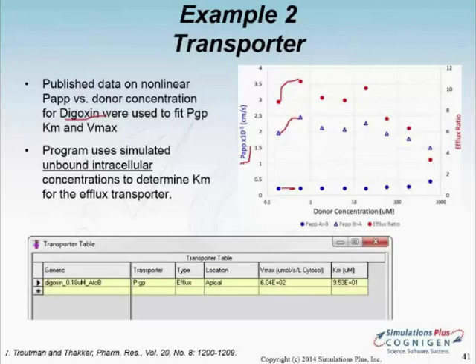So the rate of permeation was changing. How quickly the system was coming close to equilibrium was changing. But the other thing you need to keep in mind is that I showed those on a log scale, so on a regular scale you would see slight differences at least, especially in the basolateral compartment. But the initial concentrations in the experiment were the same.